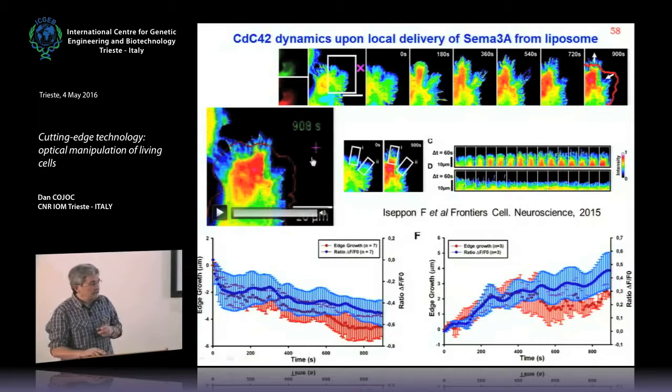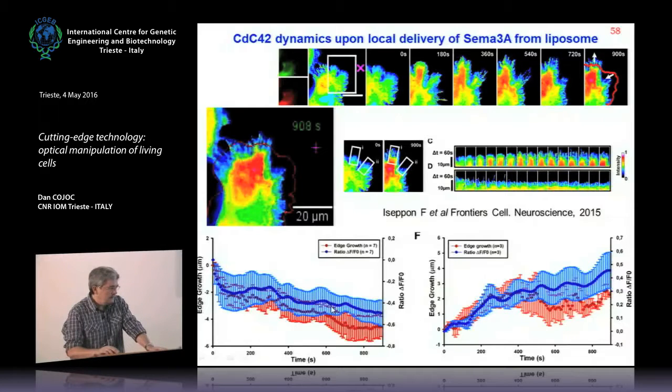And this might be related somehow also with the mechanisms that Matthew showed before. What was relevant here, observing the two signals in two regions with the edge growth, is that we were interested where the protrusion was obvious and where we had retraction.